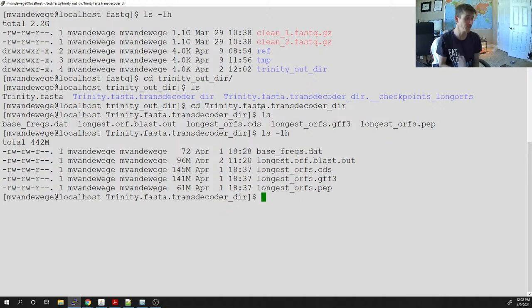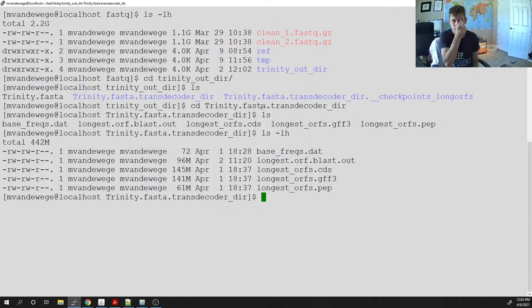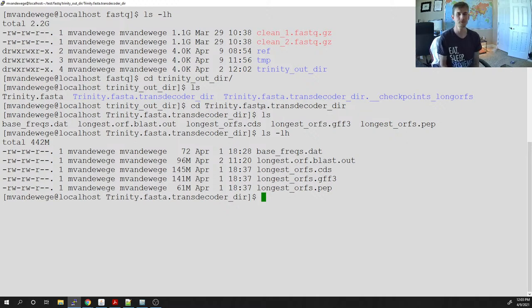I moved it to another directory just to keep things clean, because some of the next steps the directories can get a little bit messy. Once we have a reference and our clean RNA-seq libraries, what we're going to do is find out where all of those reads came from and estimate expression for each gene.